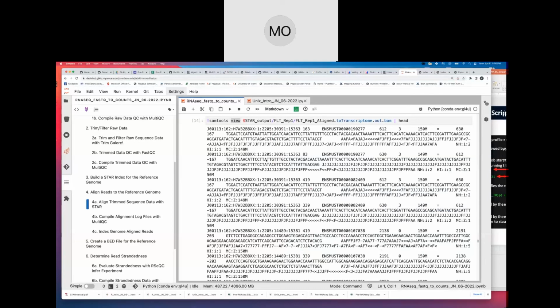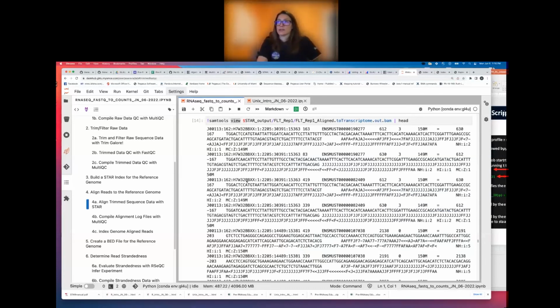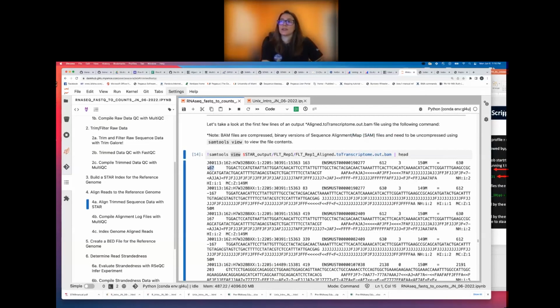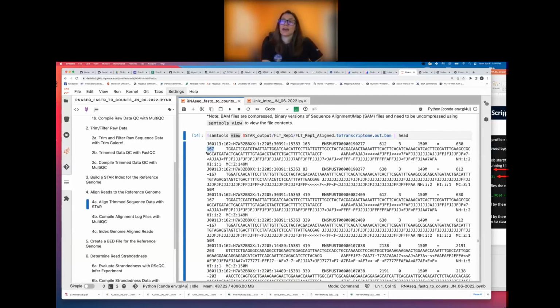And because we only have 2 mate pairs, we only have 2 templates that we're working with here. That's why in this T length column, what you're seeing is either 167, and again, positive being the same orientation with respect to the reference. So this read is going to be in the positive orientation with respect to the reference, negative being in the reverse complement orientation with respect to the reference, or this one's mate pair. And so the template sequenced using this mate pair is 167 base pairs long.